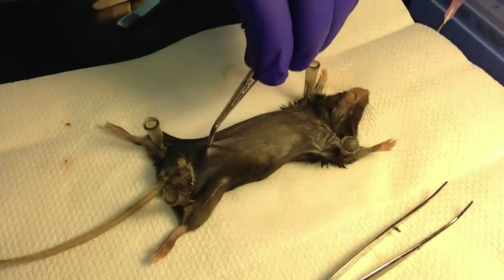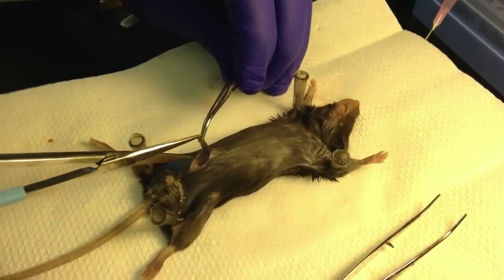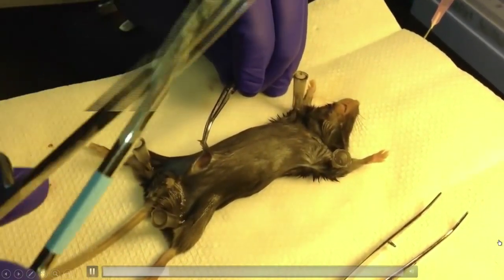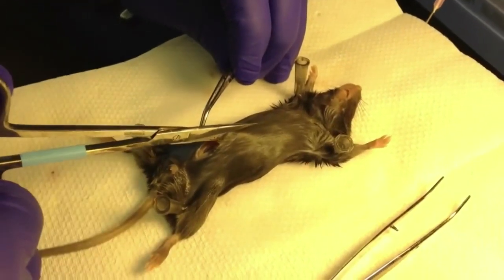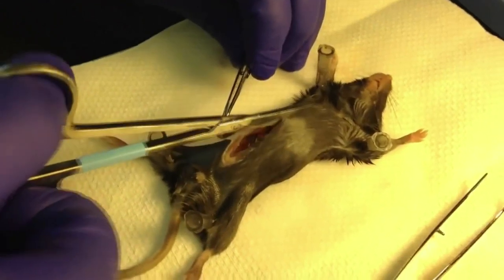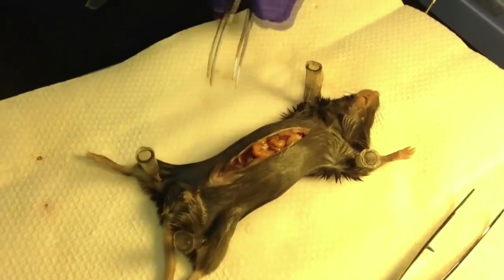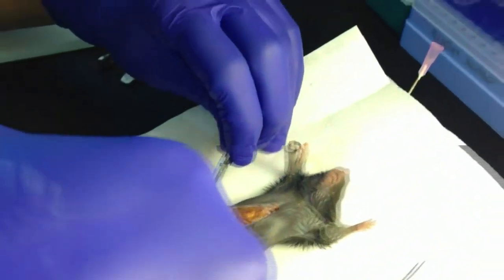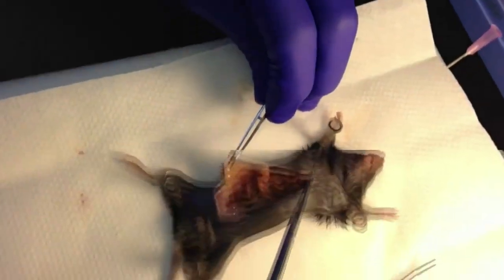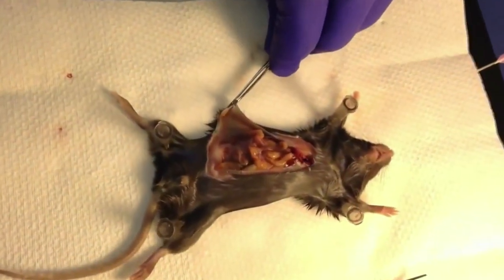And then what we do is pull the skin up and make an incision at the bottom. And then you'll see this filmy layer here. What you want is the tip of your scissors to go through that. And then you're going to cut up. So you're cutting basically the layer of film and also through the skin. And you're going to cut all the way through the sternum. Okay. And so now you're going to make some incisions on the sides. This is just to open it up to see what you're working with. It's not necessary, but you can pin this if you want to get a better look.